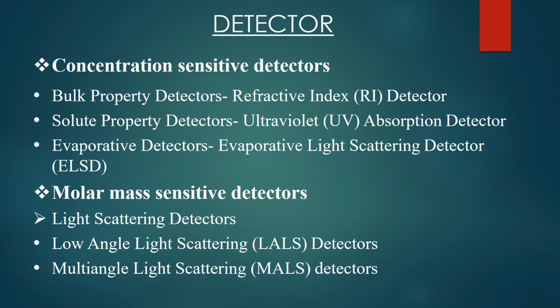Detector. Concentration sensitive detectors: bulk property detectors, refractive index detector; solute property detectors, ultraviolet absorption detector; evaporative detectors, evaporative light scattering detector ELSD.